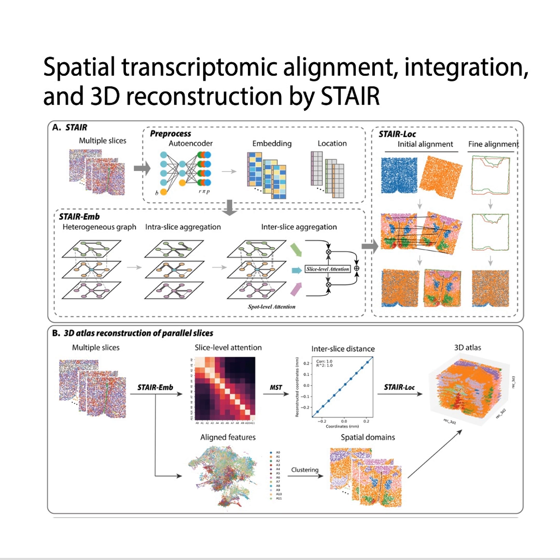Most importantly, it clearly differentiated 2 distinct types of in situ cancer, in situ cancer 1 and in situ cancer 2, and also mapped out a highly heterogeneous fibrous tissue right next to the tumor. And with these defined 3D boundaries, they could actually start to trace the disease's progression.